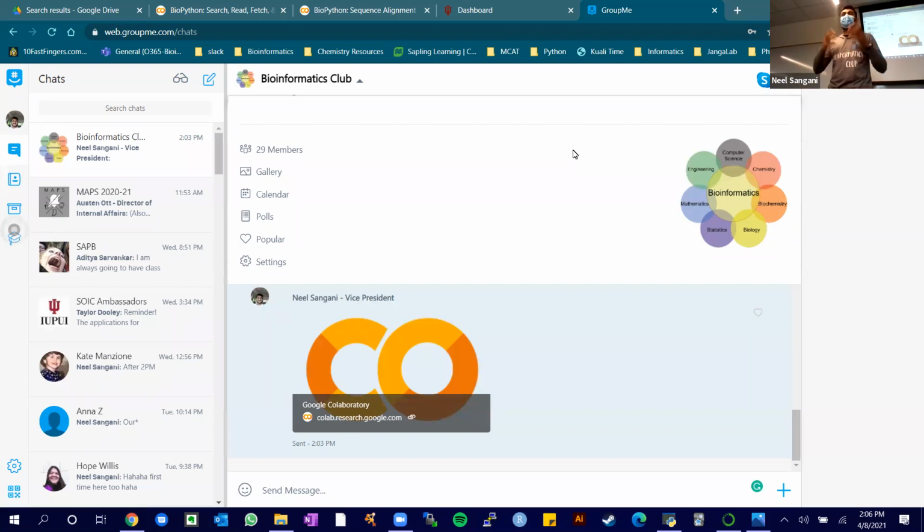You can get a pretty big picture so far: if you can get a file from NCBI, put it together in a big file, and then do alignment, that's practically the entire project that you'll be asked in some of the classes.